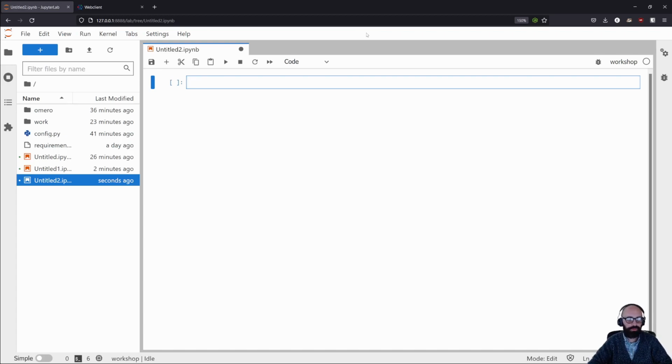So again, I'm going to plot the first time point, first channel, first slice of a 5D image. And in this case, feel free to pick any image ID that you have on your server. In my case, I have two options, but if you have different server, for example, or if you've put more data there when you were importing images, feel free to pick any image ID you have there.